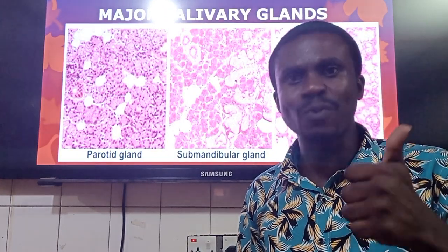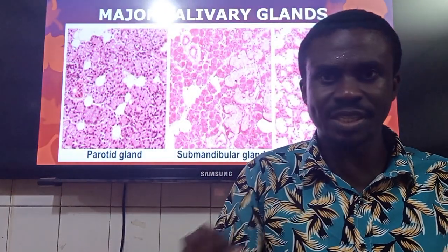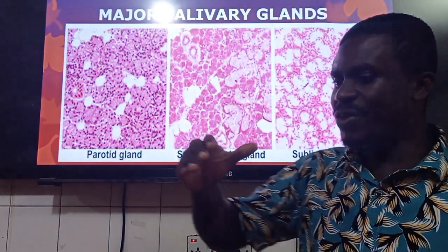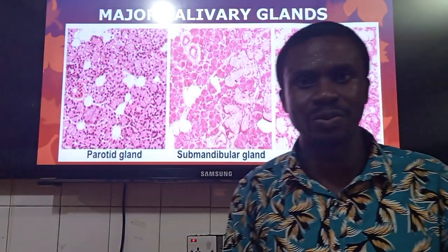Okay, now the next one, where is the fourth one? Running in these connective tissue septations will be ducts. We call them interlobular ducts, because they will be found in between the lobes. Interlobular ducts, in between the lobes.